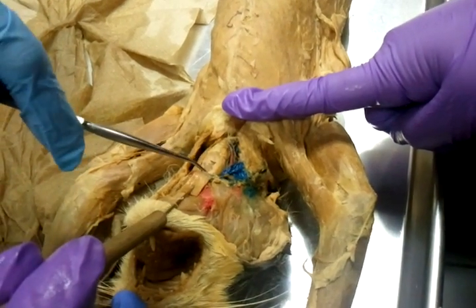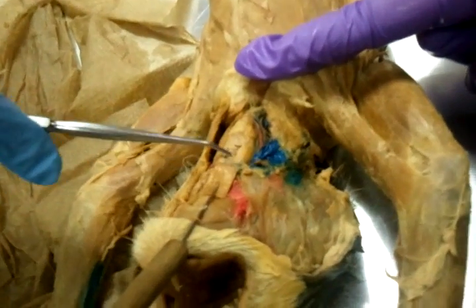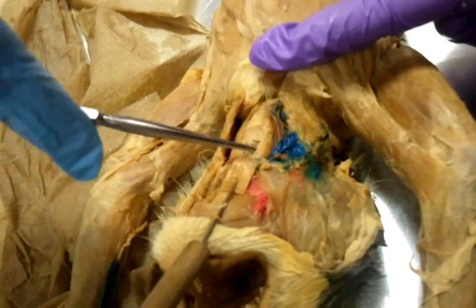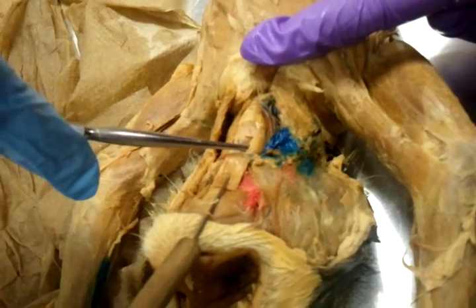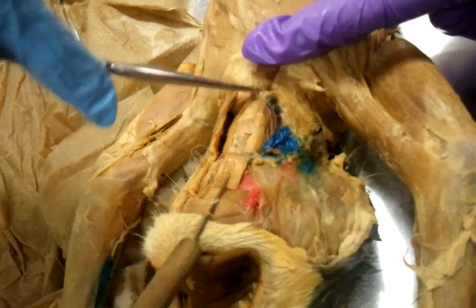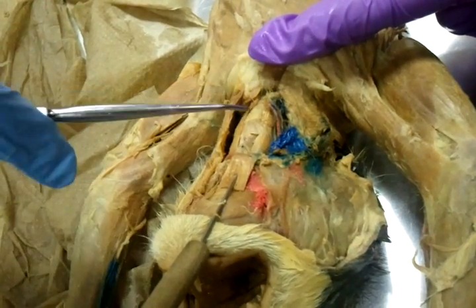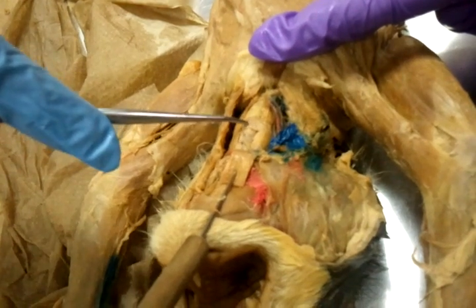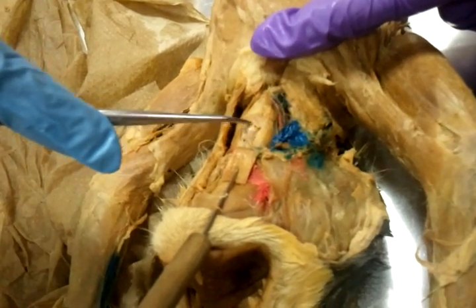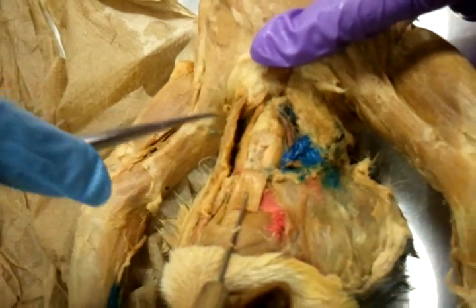The most superior muscle here is going from your thyroid cartilage to your hyoid — this one is your thyrohyoid. And then this one is going from the sternum to the thyroid cartilage, so this one should be your sternothyroid. And here, between your cricoid cartilage and your thyroid cartilage, you'll have your cricothyroid.